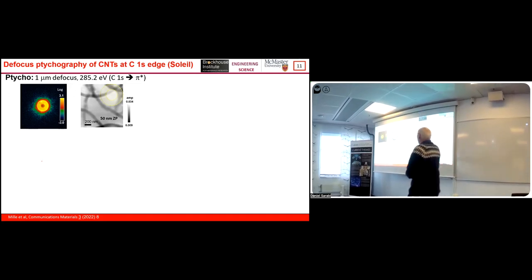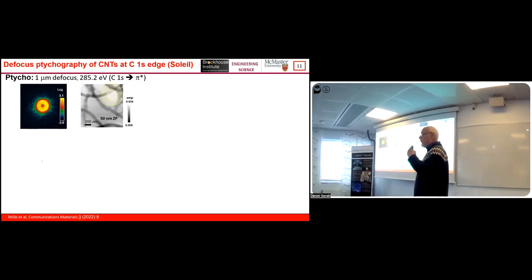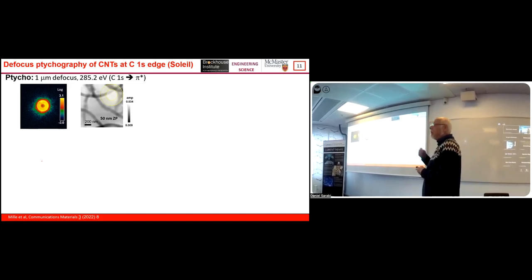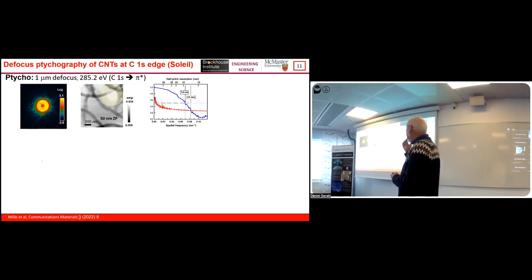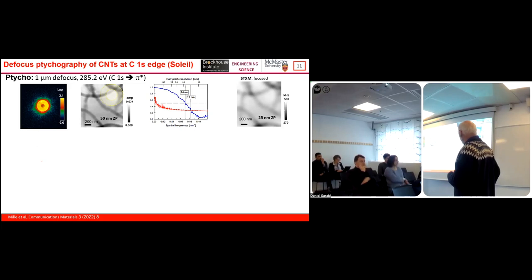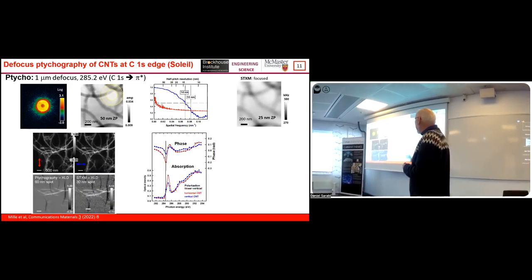So you can see that this is basically the spatial shape of the X-rays that we put in, because at one micron, the projection of the annulus of the zone plate is where the light is. And you can see only about 30% of the light is hitting the actual carbon nanotubes, which are going to give us the spectral signature. We get reasonable resolution, not as good as we hoped for, for various reasons. And if we compare to a high resolution zone plate STXM, we don't see a heck of a lot of difference in spatial resolution. But we do have some advantages.